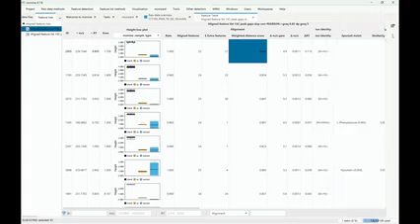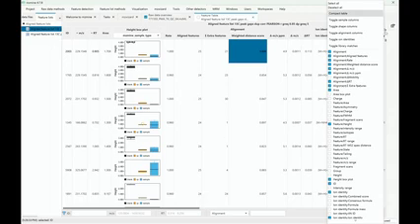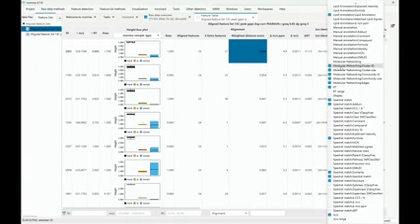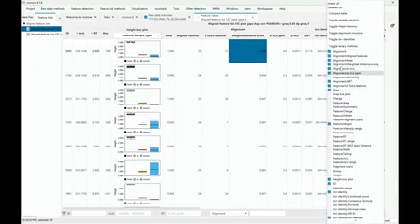And so if you open the table, there's this plus, and in this plus there's a couple of toggles to turn things on and off. There's a lot of check marks, and you see there's all the data, all the results that you can visualize in the table.